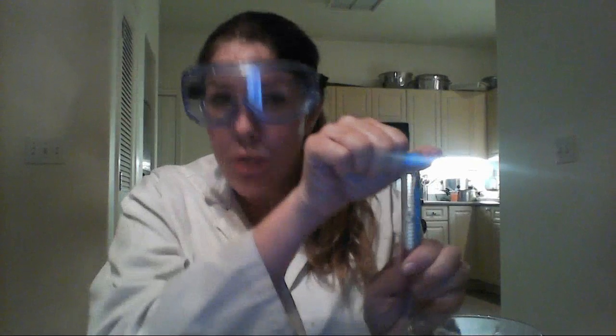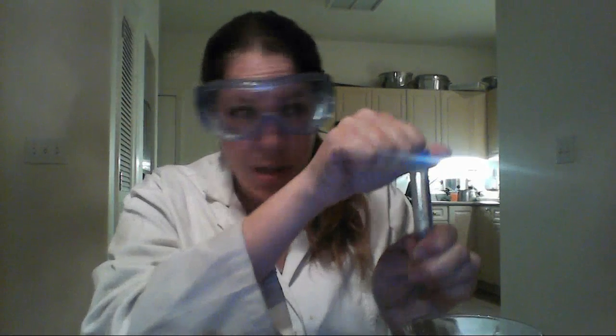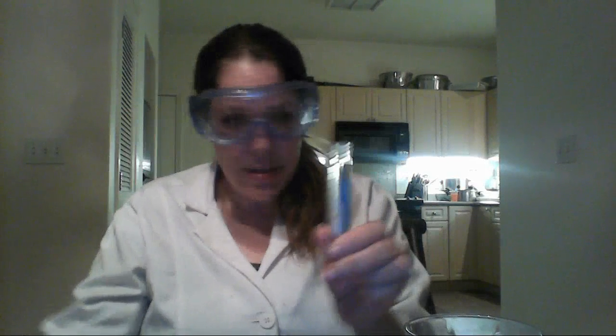You can see it with the naked eye, and now we're going to take it out and stick it into our little necklace tube here. So here's how you want to do this. Again, you want to be wearing your PPE because you don't want ethanol splashing in your eyes. Just very gently, without doing too much mixing, take the tube up, and now use that same pipette. Make sure it's good and squeezed out.